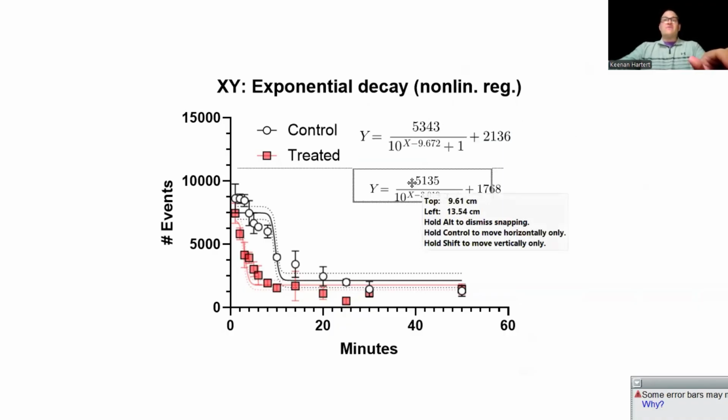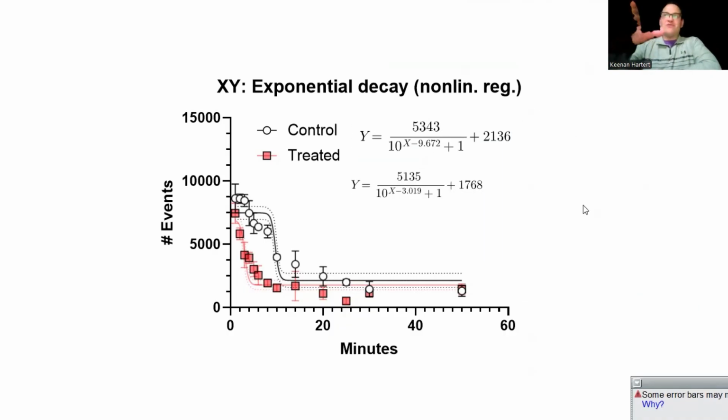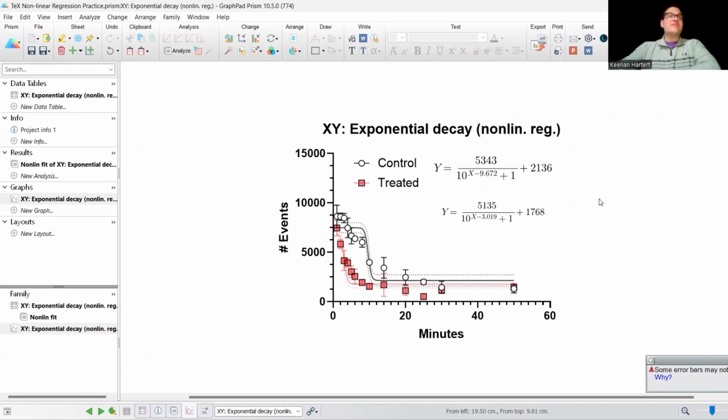So remember, I just wanted to run a model that was going to have a few more notations for the TeX right there. But if you have a simpler model, it'll give you a simpler setup, then the format will still remain the same. So that's how you access the universal TeX model and equations.